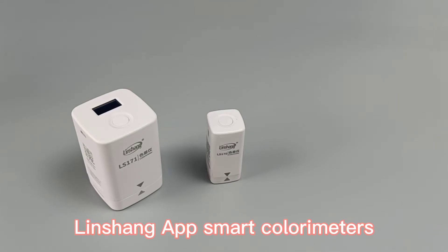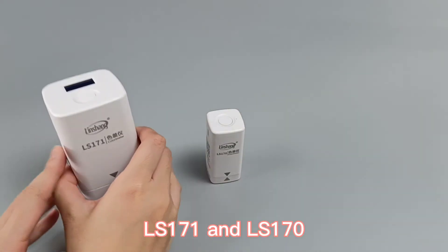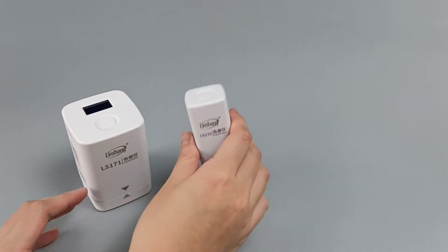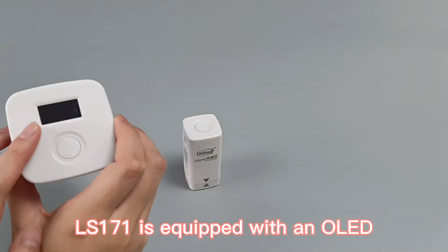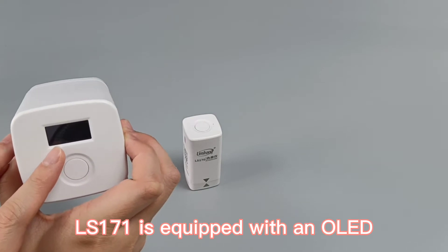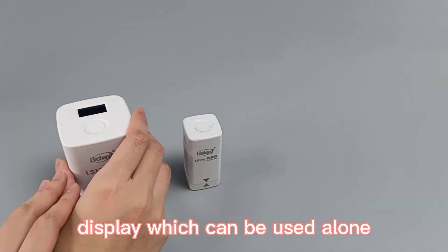Linshan app smart colorimeters LS171 and LS170. Both colorimeters are used along with a mobile app. The LS171 is equipped with an OLED display which can be used standalone.